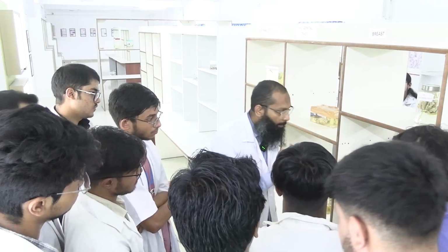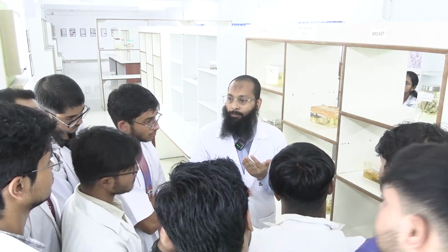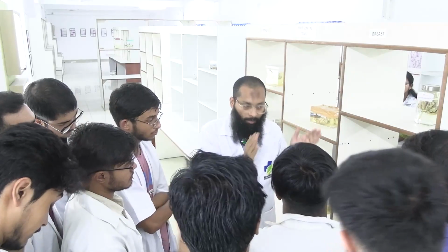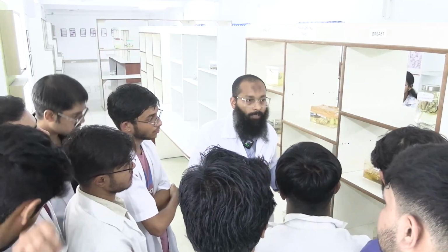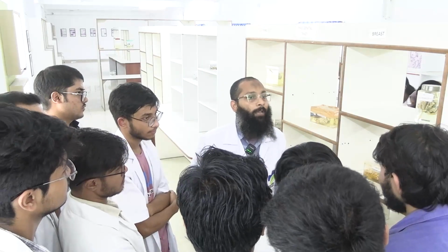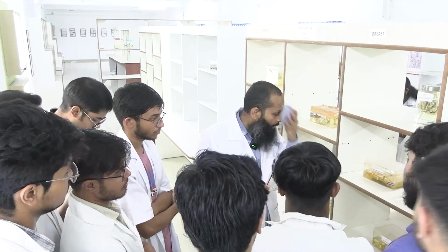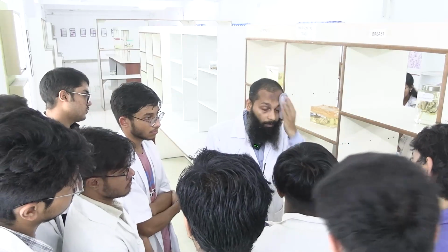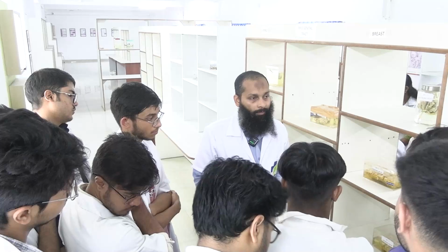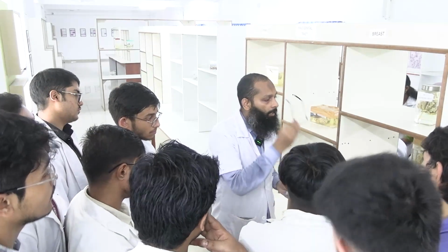The period between taking the specimen out from the patient's body and putting it in a fixative is called cold ischemia time. Ideally it should be within 30 minutes, half an hour, but it should not be more than 1 hour.